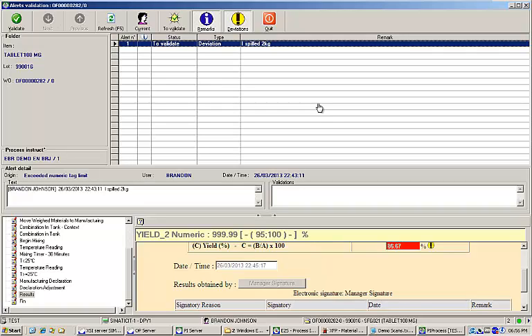You can also see the comment I typed explaining that I spilled two kilograms of material. More importantly, the bottom of the window shows the exact spot in the EBR where the alert was generated, so the quality auditor does not need to search through the entire batch record to find it.